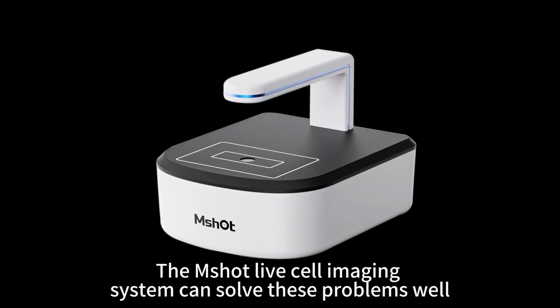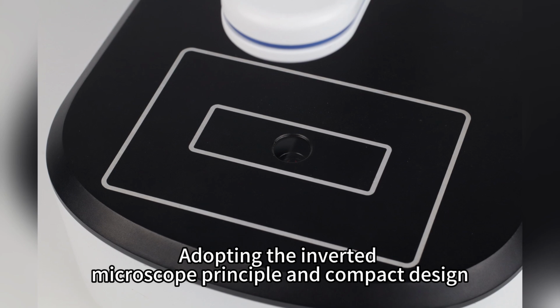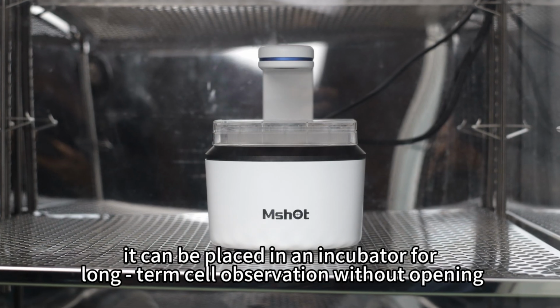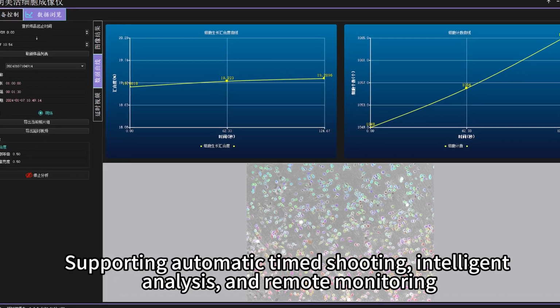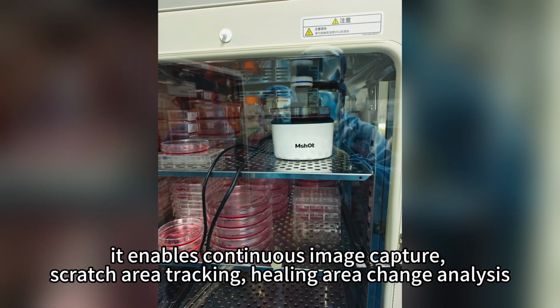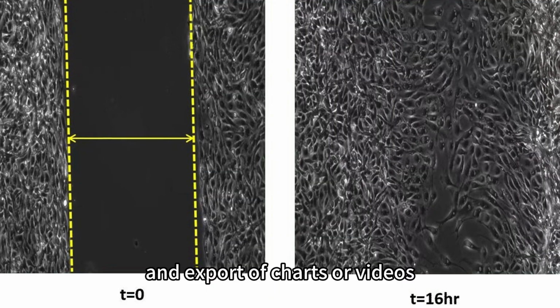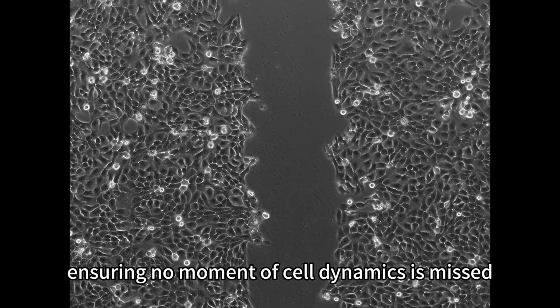The MSHOT live cell imaging system can solve these problems well, adopting the inverted microscope principle and compact design. It can be placed in an incubator for long-term cell observation without opening, supporting automatic time shooting, intelligent analysis, and remote monitoring. With parameters set, it enables continuous image capture, scratch area tracking, healing area change analysis, and export of charts or videos, ensuring no moment of cell dynamics is missed.